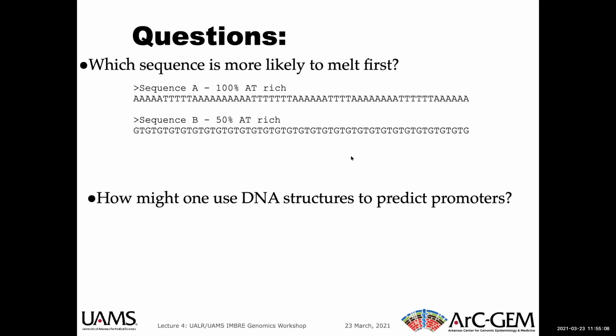Now you don't need to do rigorous calculations. It turns out you could actually do some fairly quick calculations. Some people do all these melting calculations and it takes hours and hours for a little 20 base pair primer. That's stupid. There are things you can do that take just a few seconds. If you're interested, we could talk sometime about how to better design primers. You want to avoid G's in a row if you can. Right. In primers.